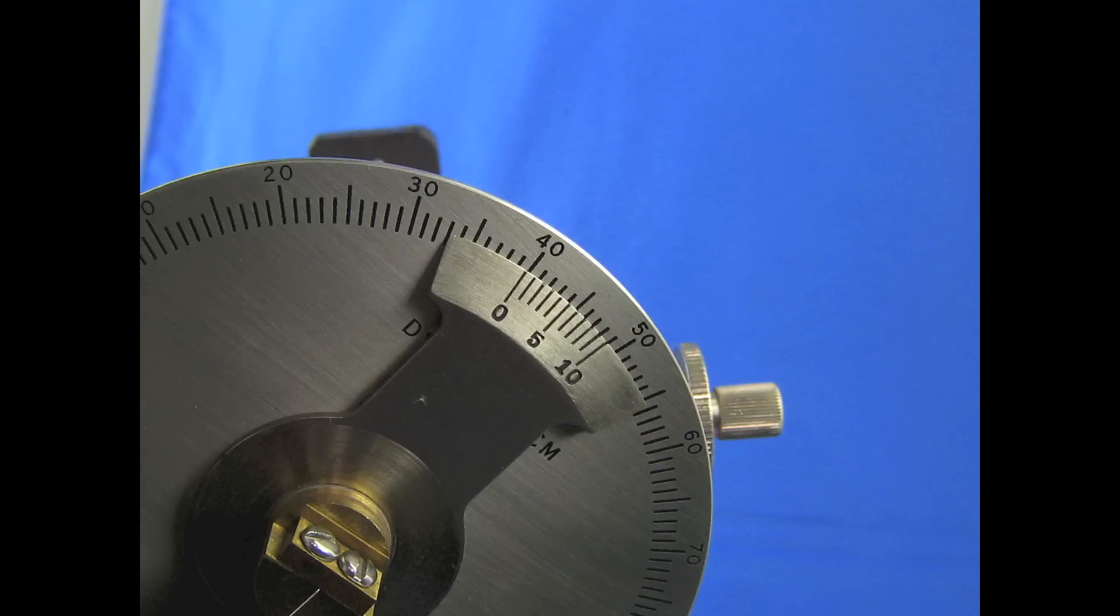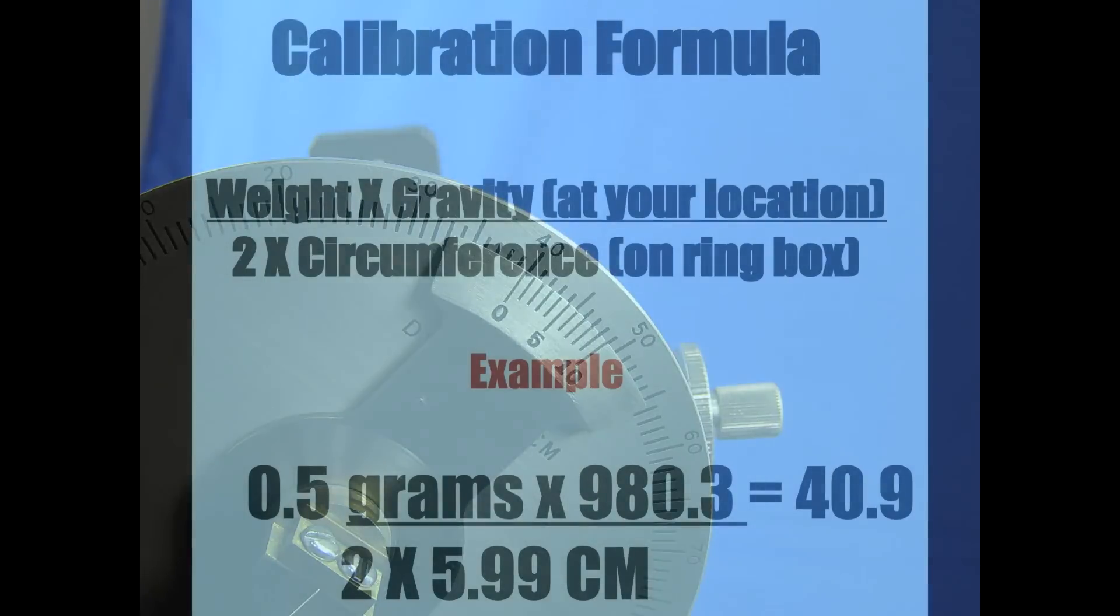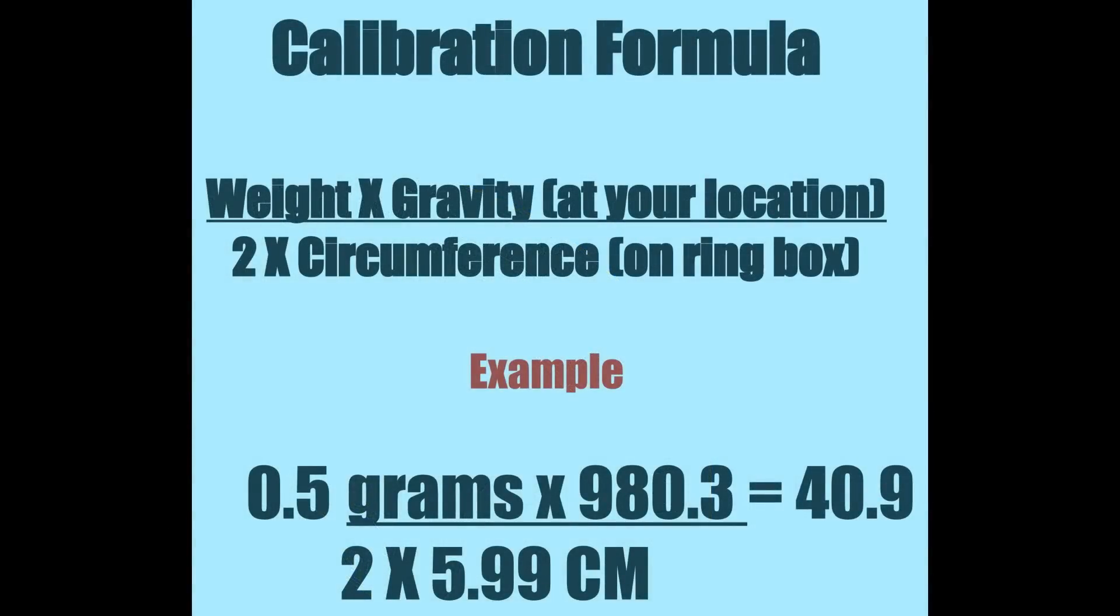Set up to calculate the calibration number. This is the weight put on the ring times the gravity at your location. You can get this from the National Geodetic Survey. This number is divided by two times the ring circumference.